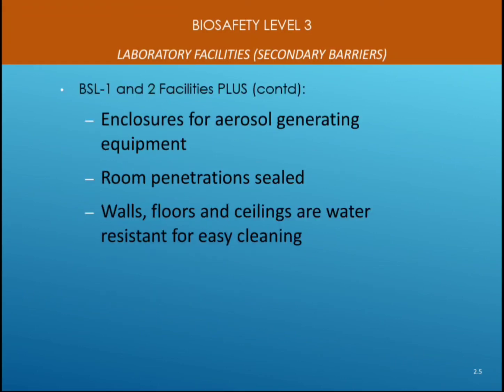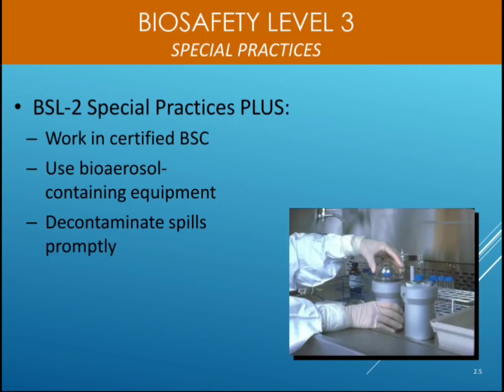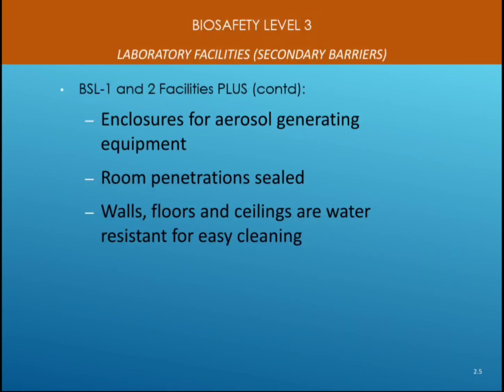BSL 1 and 2 facilities plus enclosures for aerosol generating equipment. Then room penetrations should be sealed. Walls, floors and ceilings are water resistant for easy cleaning. So this was all about the things, and the rest we'll discuss in the next lecture.